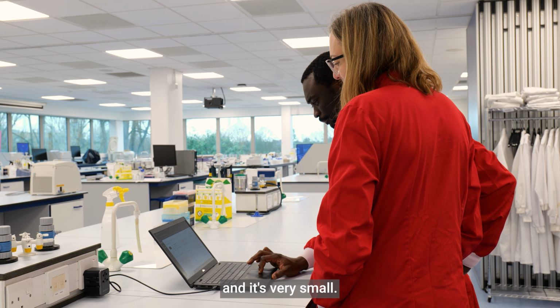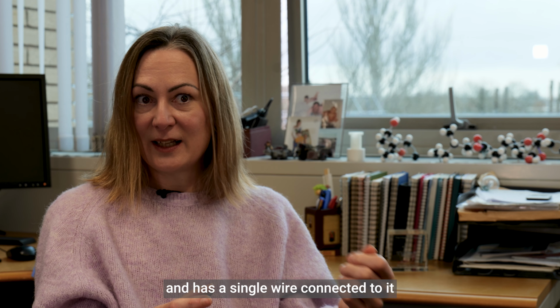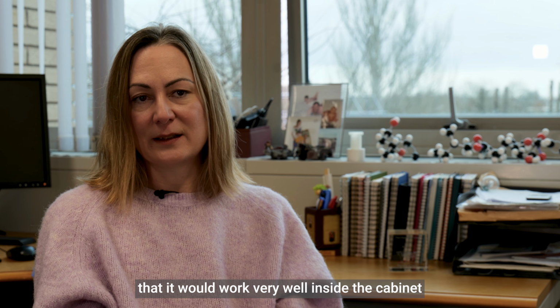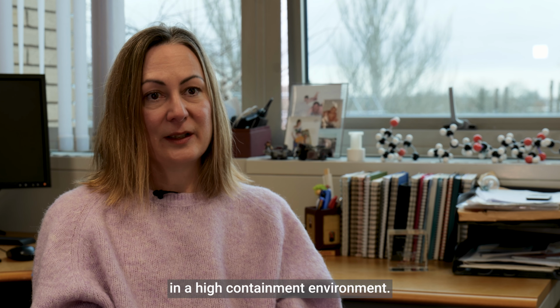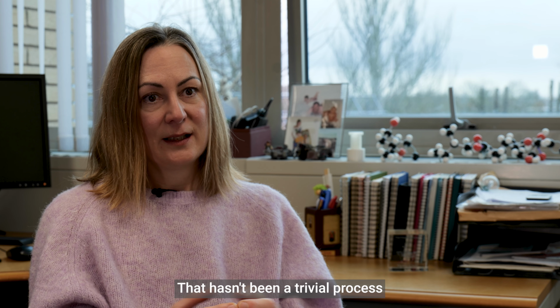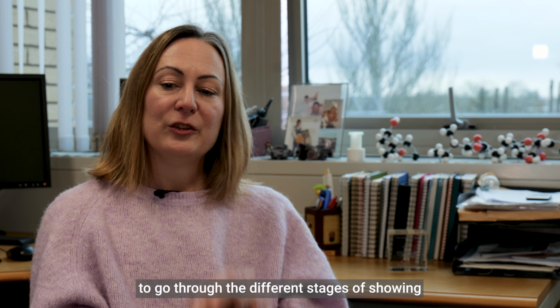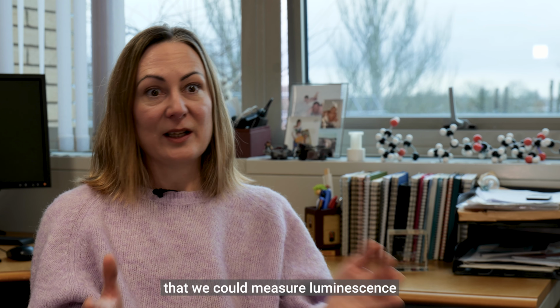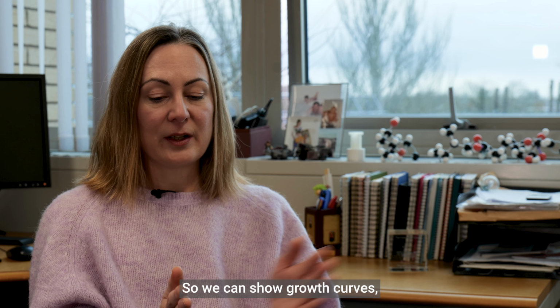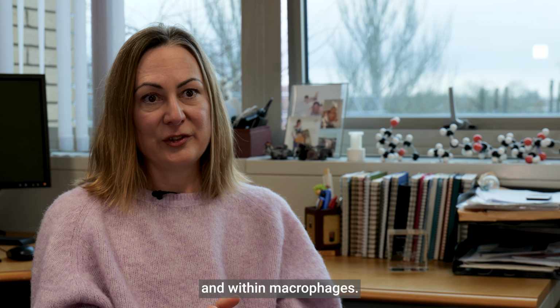It's very small, it's not much bigger than a 96-well plate, and has a single wire connected to it, and I could see immediately that it would work very well inside a cabinet in a high containment environment. The major step forward is showing that we can do it. That hasn't been a trivial process, going through the different stages of showing that we could measure luminescence at all using the technology. So we can show growth curves in planktonic culture and within macrophages.